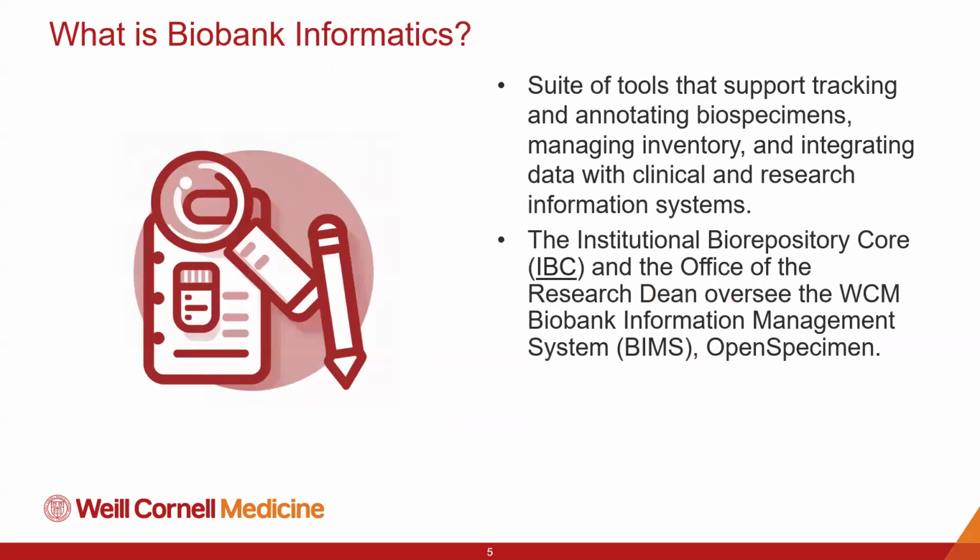So let's take that a step further and talk about what is biobanking informatics or biobank informatics. That is a specialized group and we provide a suite of tools that supports the tracking and annotation of biospecimens. All of the data that is associated with an actual biospecimen that's collected from a person, that's what we focus on tracking and documenting in a very specific system.